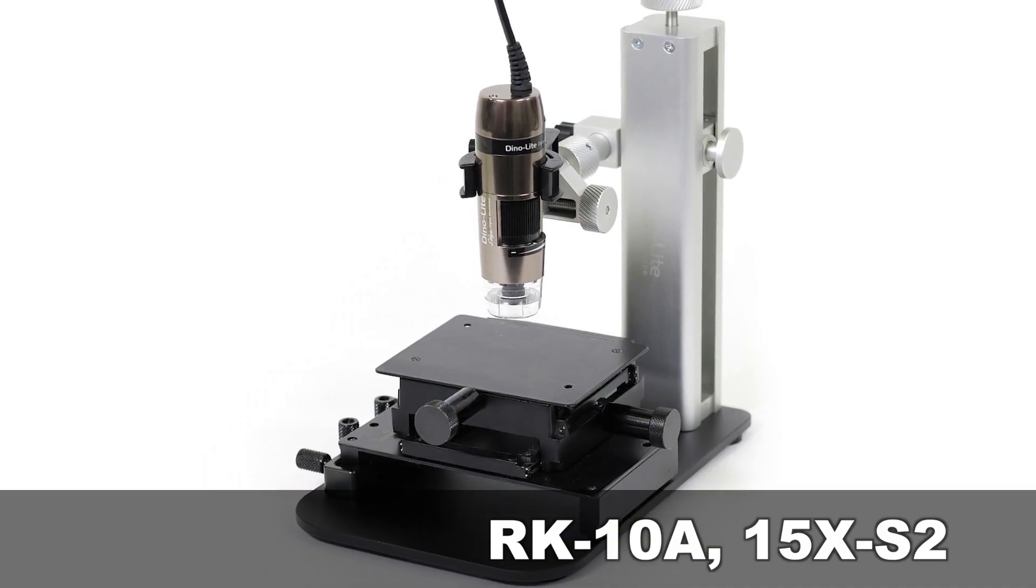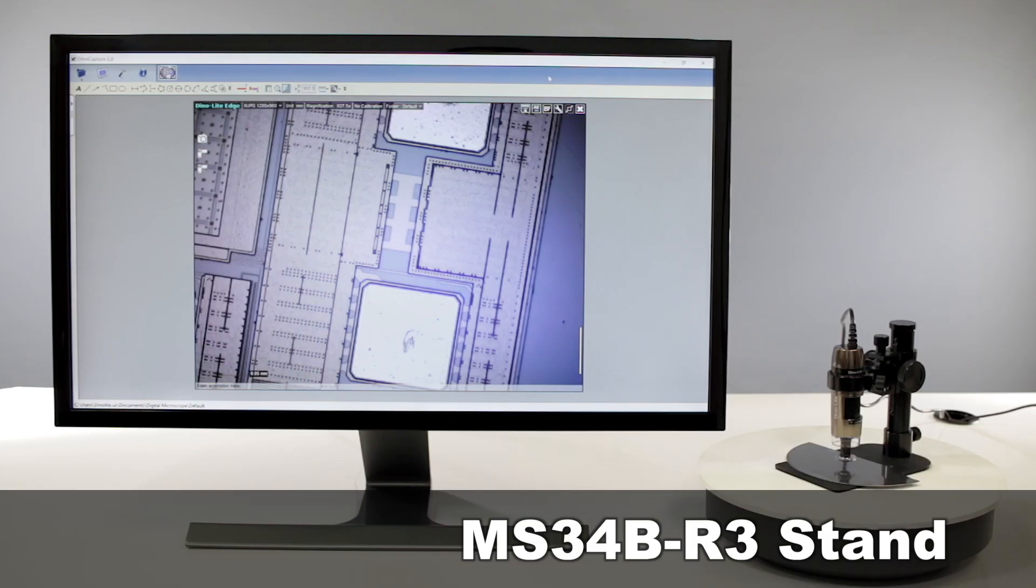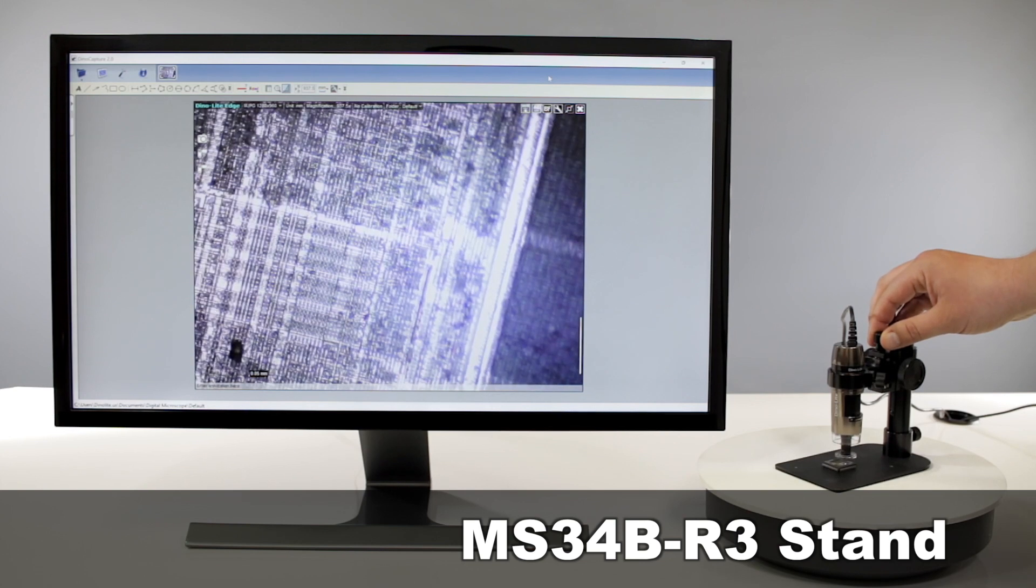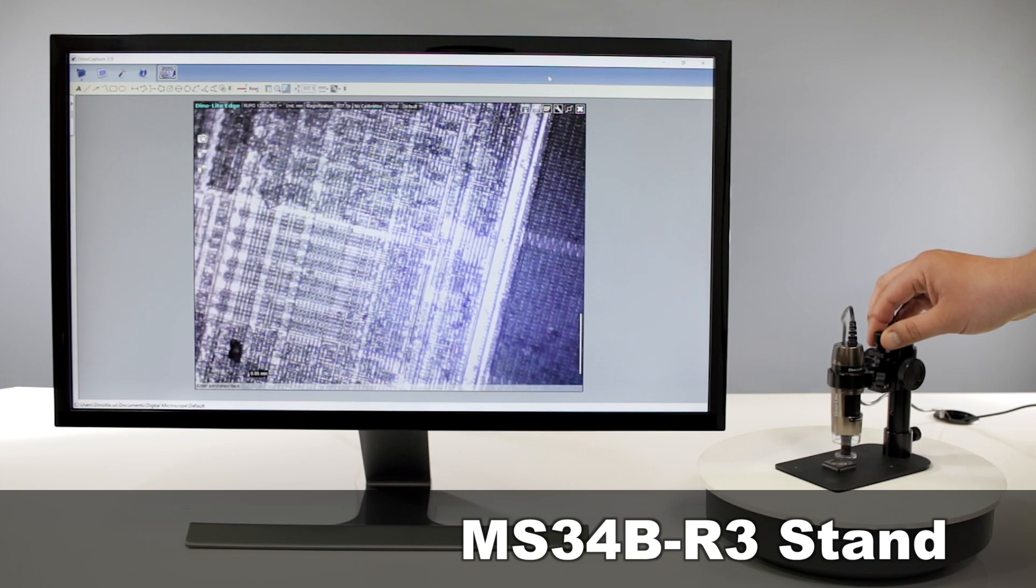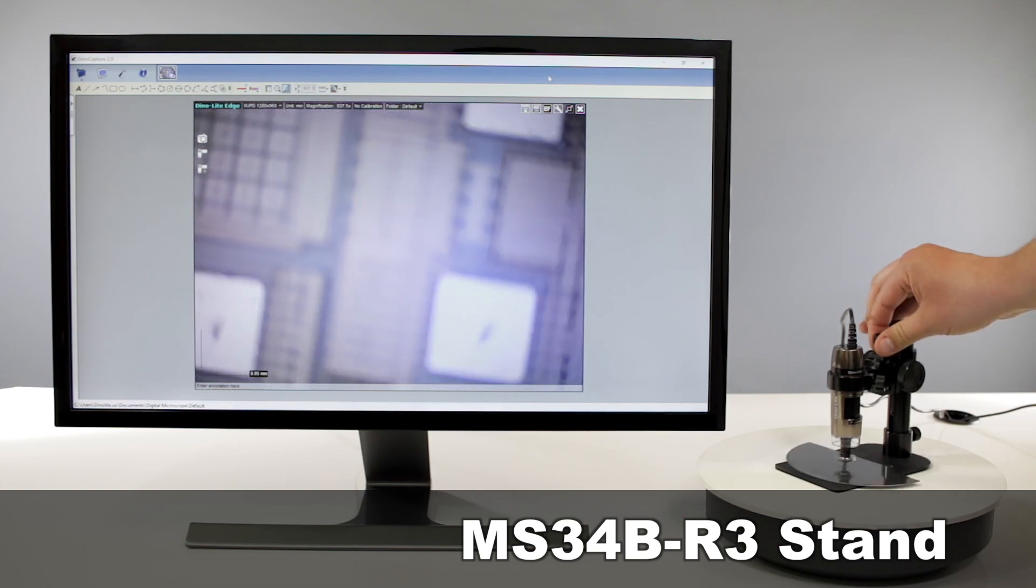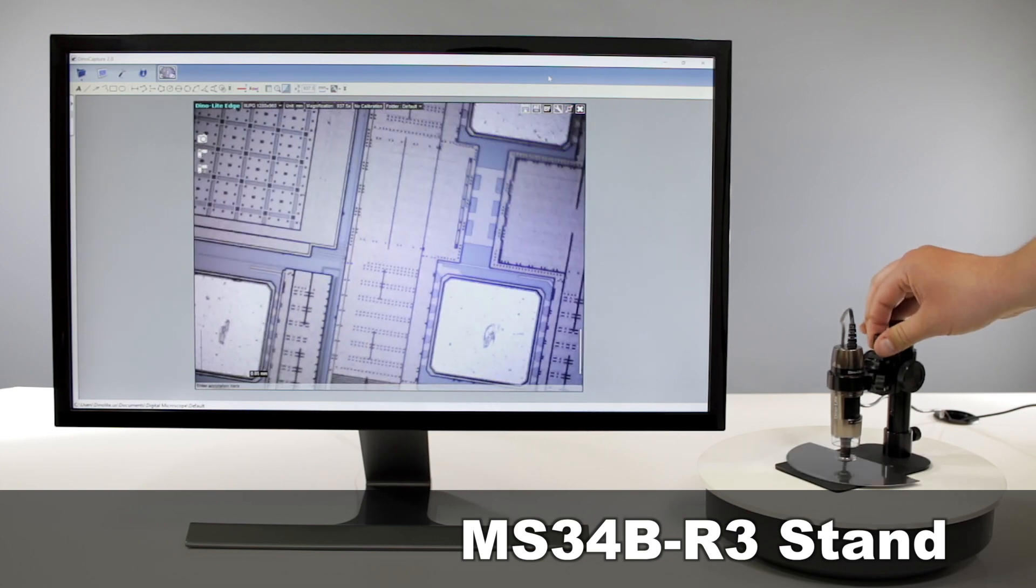Having a stand with fine adjustment is necessary for higher magnifications to help with focus adjustment.